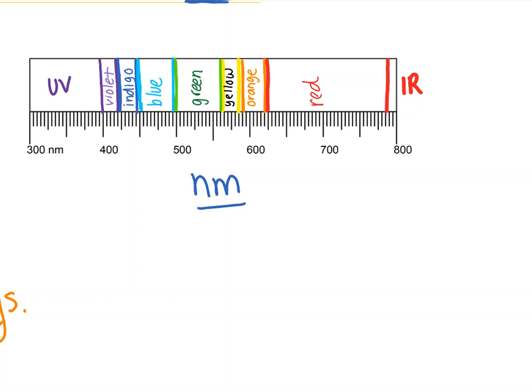Anyway, I'll leave it to you to figure that out, looking at where they cut off. If you have something that's red and you want to state its wavelength, it's okay to just estimate in the middle of red and read off a wavelength. If something is described as orange-red, then just go with the transition there. This will give you cutoffs for the different light, and they're a little subjective, so that's why I give you this.